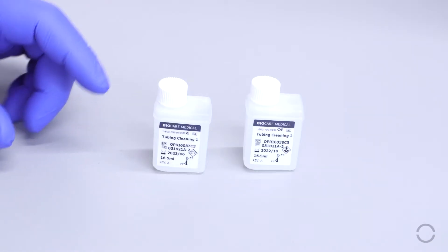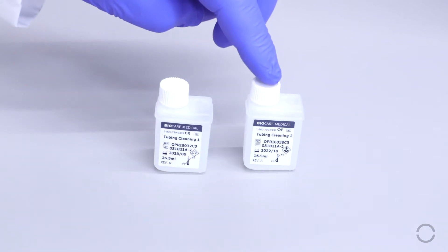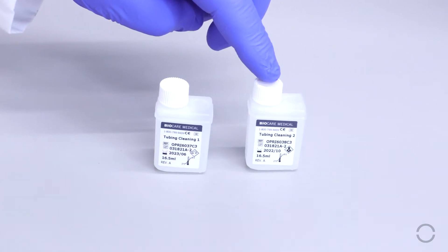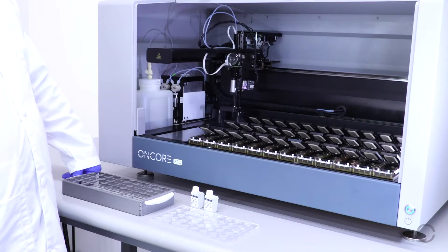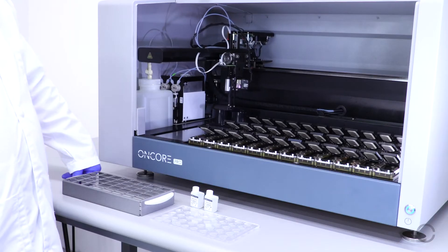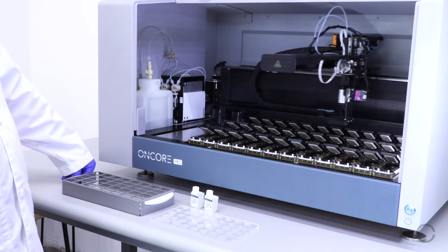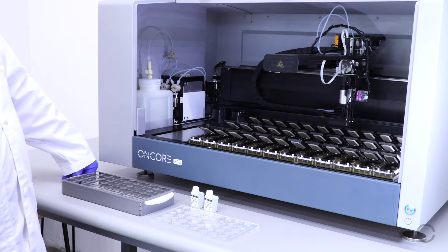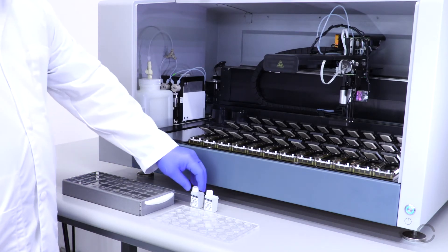To perform the tubing cleaning, you will need tubing cleaning reagent 1 and tubing cleaning reagent 2. Make sure the instrument arm is moved aside for loading and unloading. To begin, take tubing cleaning reagent 1 and load it into position 1 in the reagent tray.